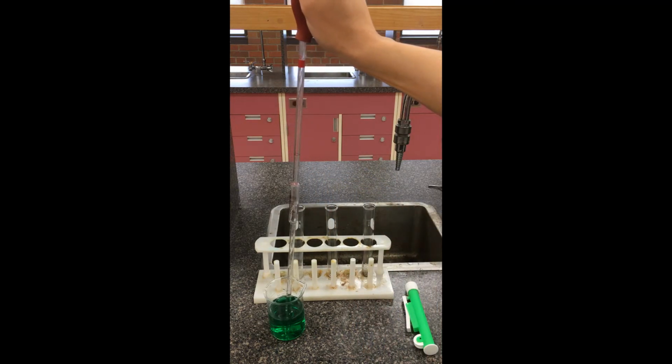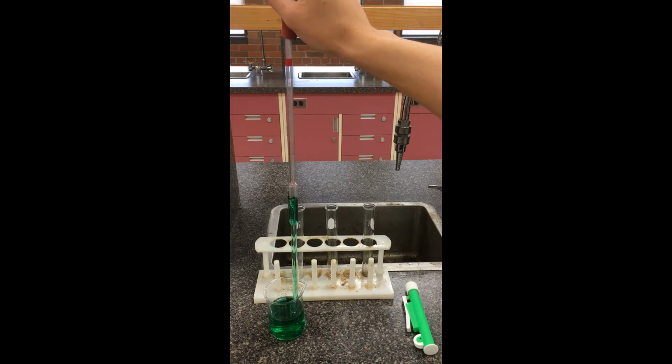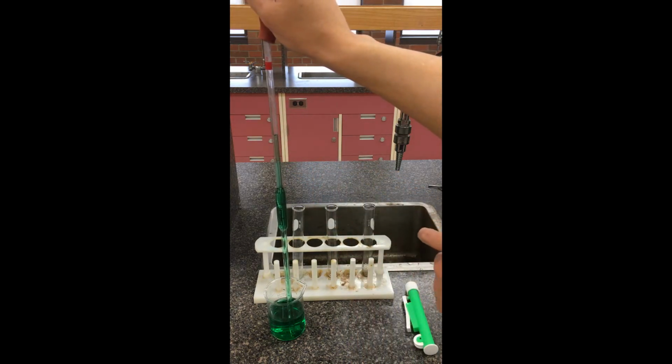As I steadily let go with my right hand, you'll see that the negative pressure sucks up the solution into the pipette. I'm going to look for this to go past the line first. I want it to get exactly 10.00, but sometimes when I pull off the bulb and put my finger on top, I might lose a little bit of liquid. So here's the line, and right now my liquid line is a little bit higher than it, which is good.